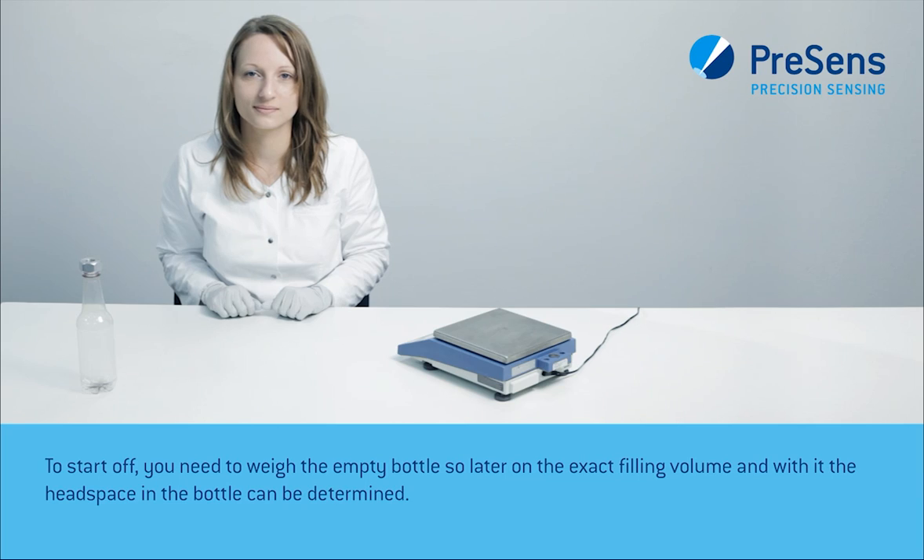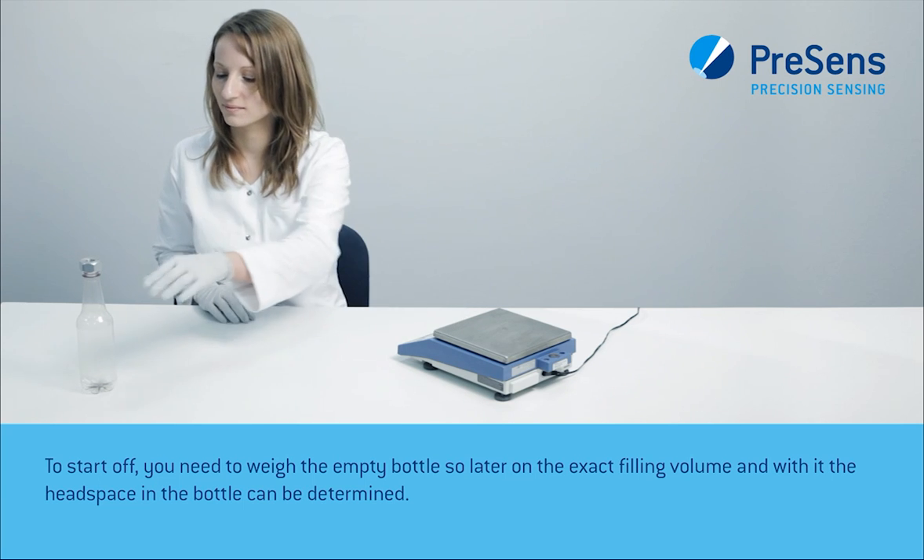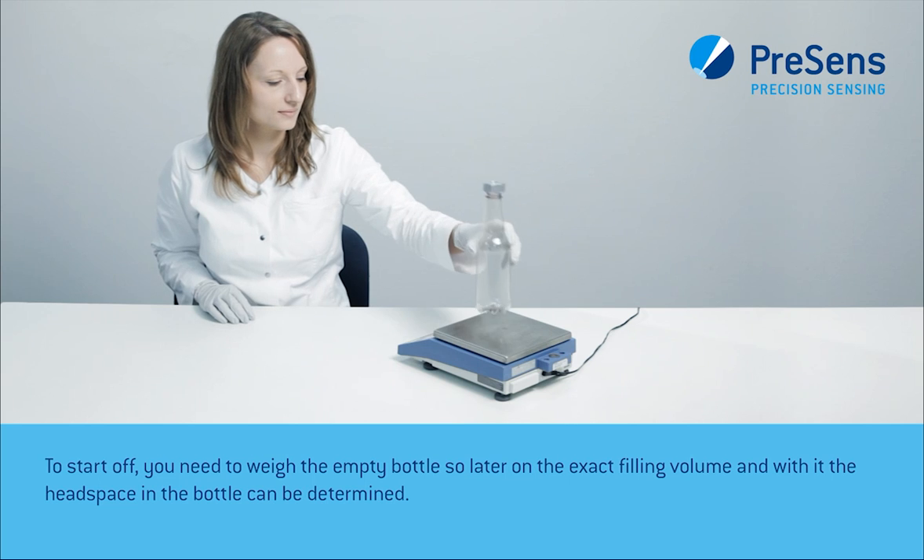To start off, you need to weigh the empty bottle so that later on the exact filling volume and with it the headspace in the bottle can be determined.